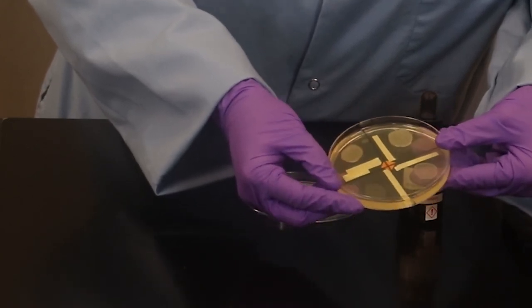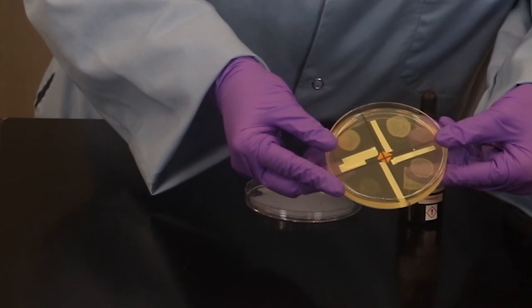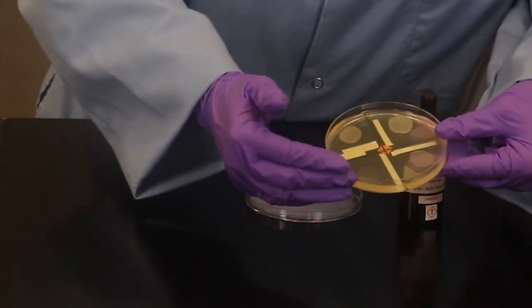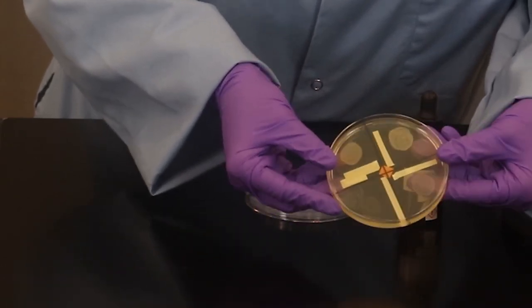And take note, it could not grow aerobically, right? So we're going to explore the oxygen requirement for this bacterium in our lab as well.